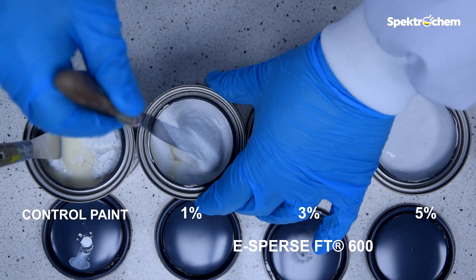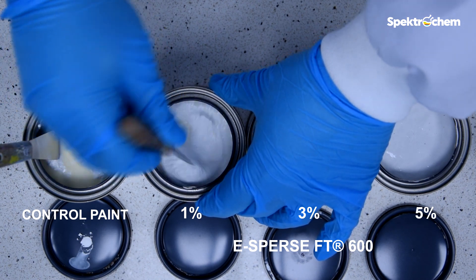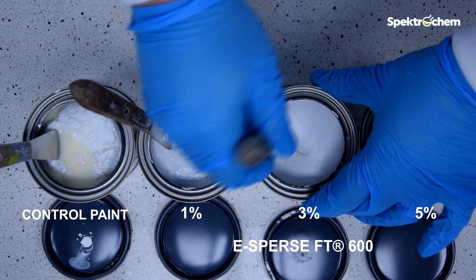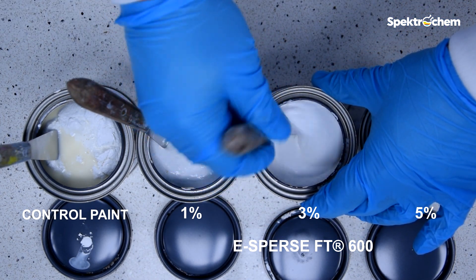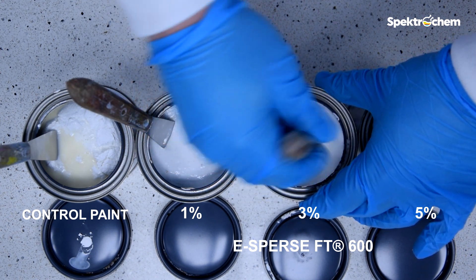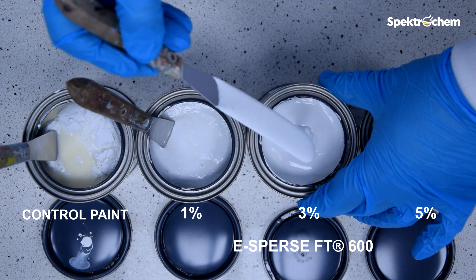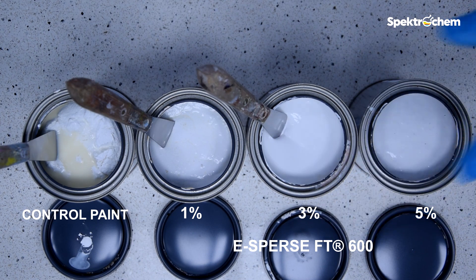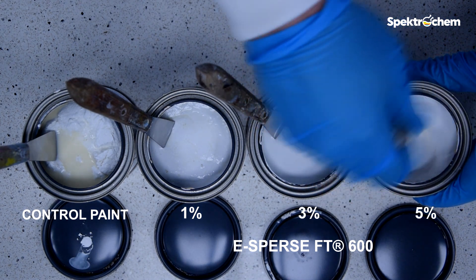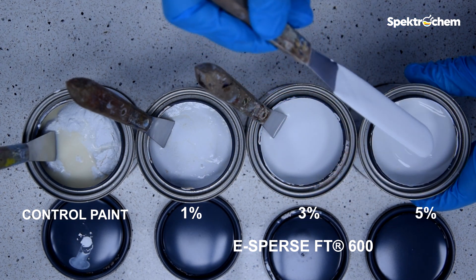The paint with 1% ESPERS FT600 is liquid. It also contains lumps, but it's not as viscous. Its viscosity can be measured and the rating was given 9. Both 3% and 5% ESPERS FT600 paint samples are still liquid, show no changes, and are both rated 10.